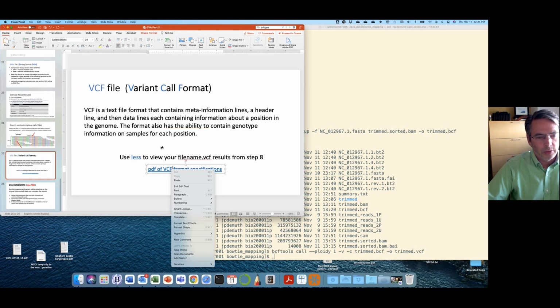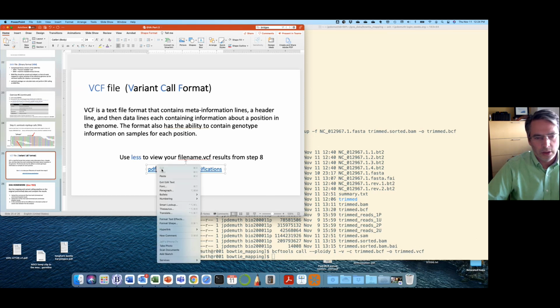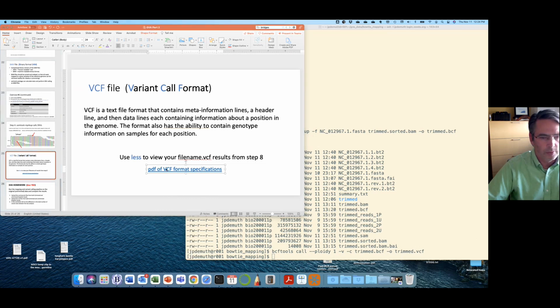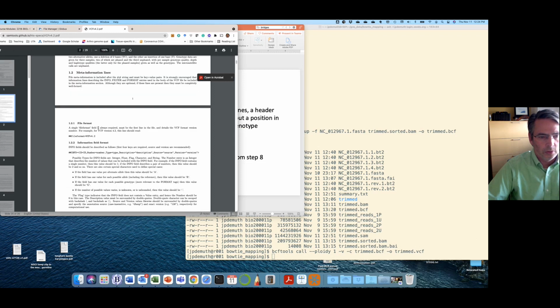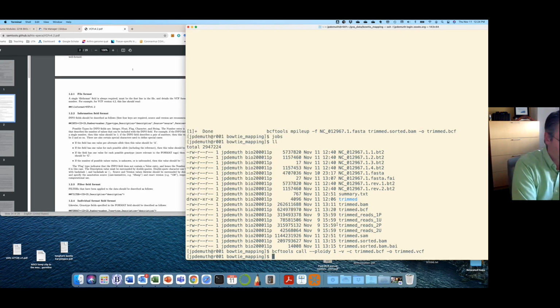So you can look at less to see our variant call. Let's open this. Do I have it open? No. All right, so less.